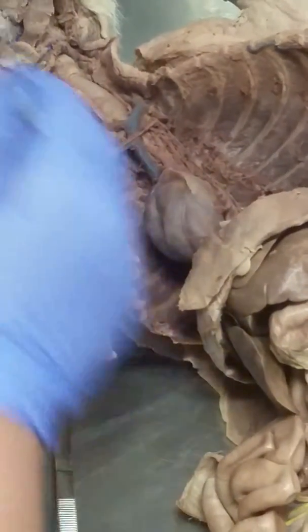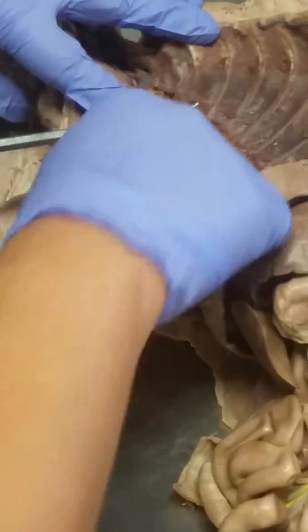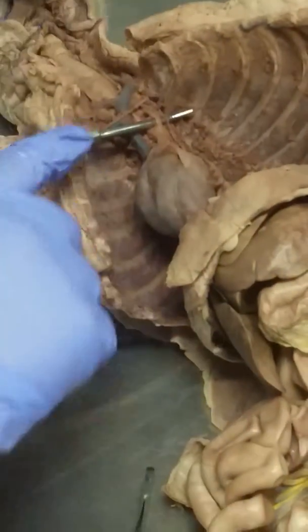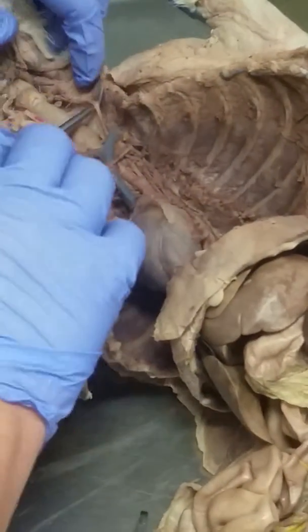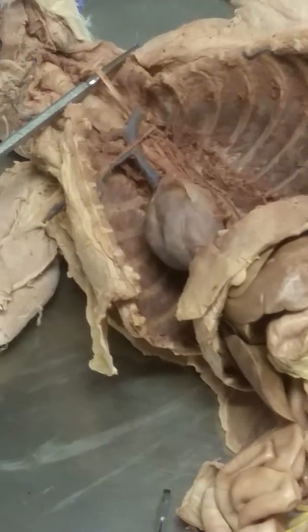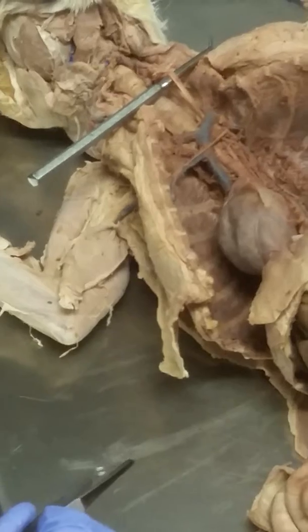Okay. Now, if we go to this part, this vessel, and I'm still talking about the brachiocephalic trunk that was right here. This vessel is the left common carotid artery. And notice, there it is. See? There's the left common carotid artery. It's currently wrapped in the carotid sheath, and you can see the vagus nerve running with it.